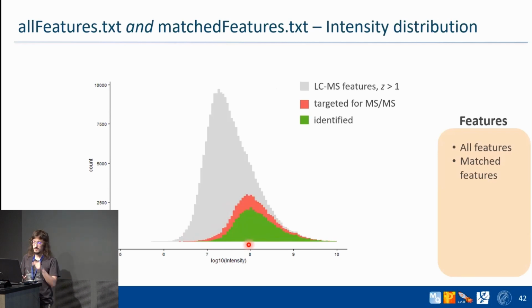This could be something you may really want to look at when you're analyzing different species together, or especially when you're doing proteogenomics. So you can see very well here how good your identification was for species specific. And then you can see how many were the features that led to a peptide, how many were those that were not used, and then look for why they were not used. Maybe I was missing a library, maybe they were too short to be identified, maybe they were just contaminants.